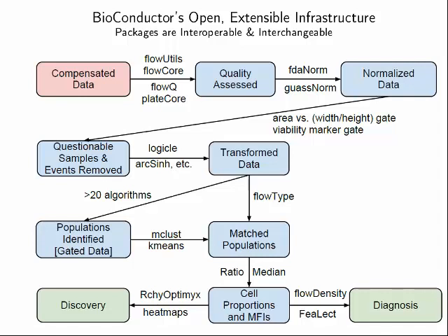But we do a lot of long-term studies, and sometimes this old data becomes a total pain. That's why I didn't want to go there, but I just stopped that. Anyway, well-compensated data, start there. Life's going to be much easier. But you guys are all doing that.